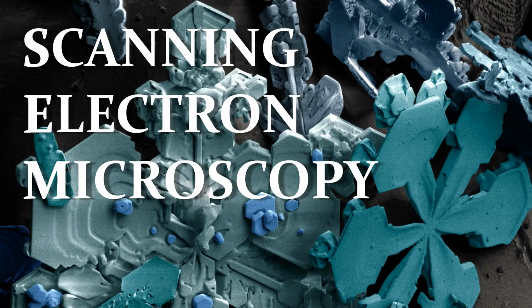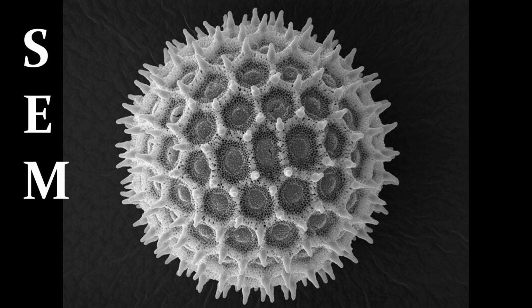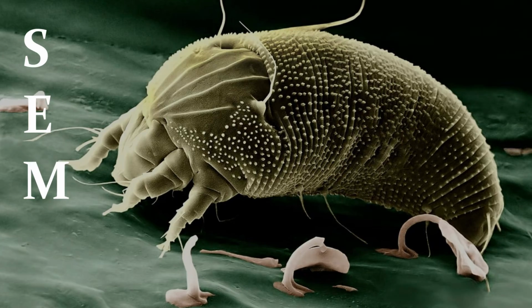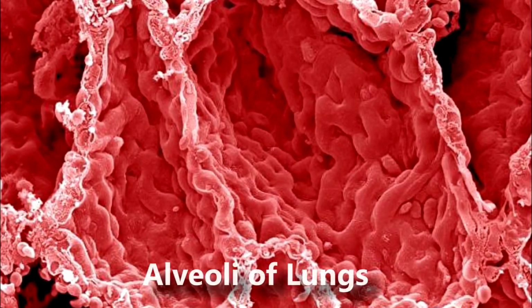Scanning electron microscopy. What type of microscopy is this? What's the finest resolution we can zoom into? What do people use it for? And why? Let's dive into the world of nanoparticles and explore what scanning electron microscopy, or SEM, is, and how we use it.